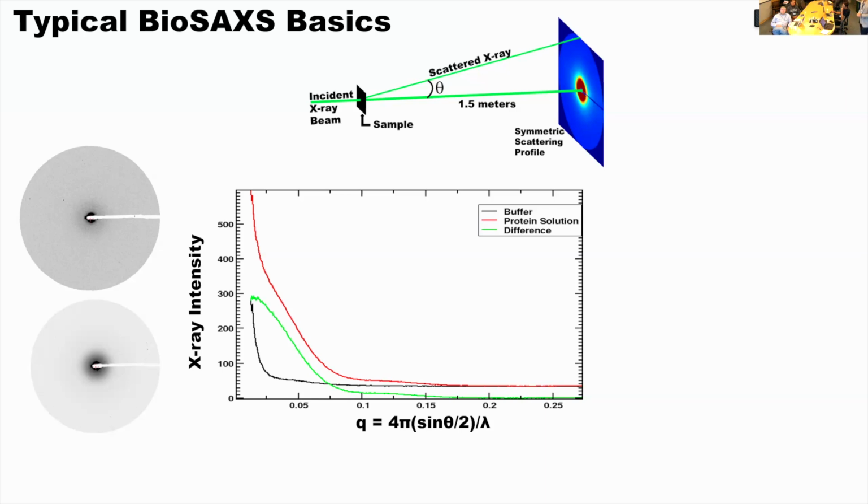Okay, and small angle X-ray scattering is a difference technique. It doesn't make a lot of sense without doing the difference. One of the reasons is because of the beam and the shadow around it. So you'll see a little darker image in the middle here. The beam itself is 10 to the 13th photons, whereas your signal may be a single photon, right? So this area is very, very bright, and we're looking right down the barrel of the beam.